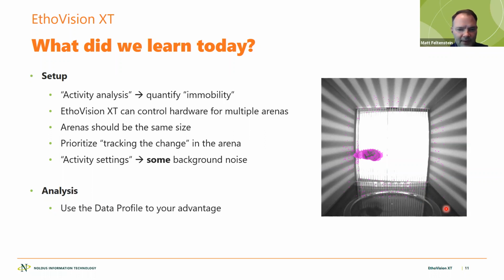So use it to your advantage, particularly here when you have different segments of time within a trial that you compare to one another. Use the nesting options within there to get the data out the way that you wish. And as I mentioned, do your settings in the analysis profile, go to your integrated visualization and see if they work. If they don't, go back to analysis profile and change, back to integrated visualization, back and forth until you get it to work.